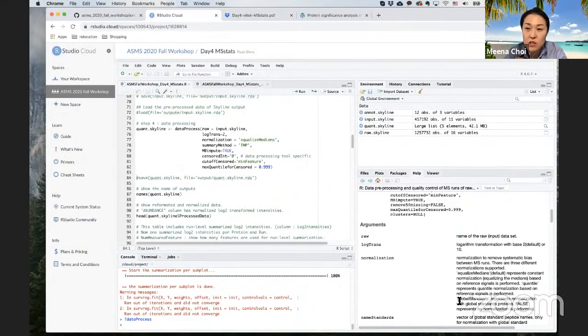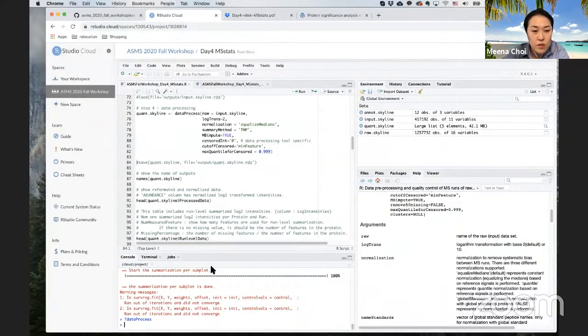To use this, you actually need to consider it before you set up the experiment. So at the beginning, during the sample preparation level, you need to consider this normalization method already, and you also need to spike in proteins. Then we can use this normalization. If you have a very specific experiment type and are not sure about the normalization, please ask a question during the TA sessions. So, right. And then, okay, so data processing.